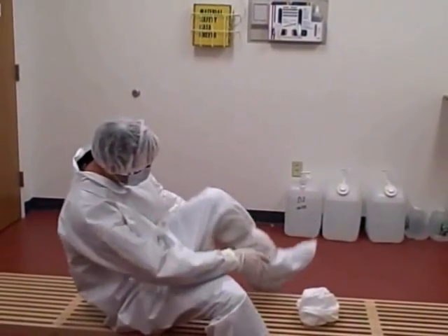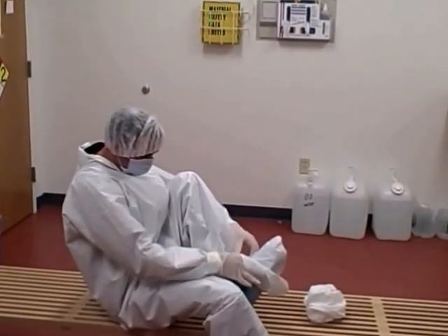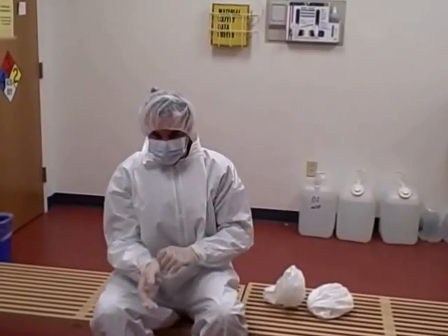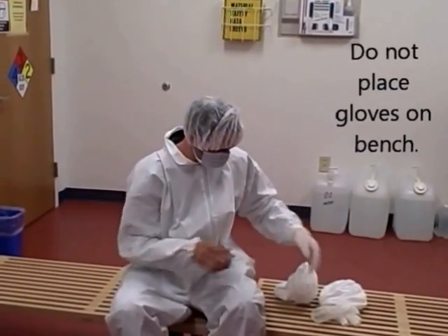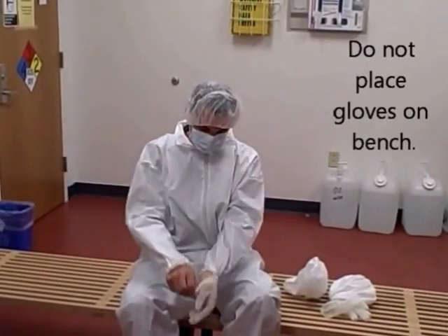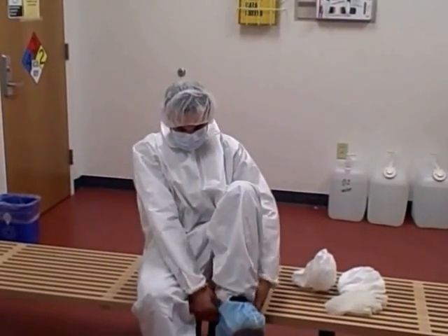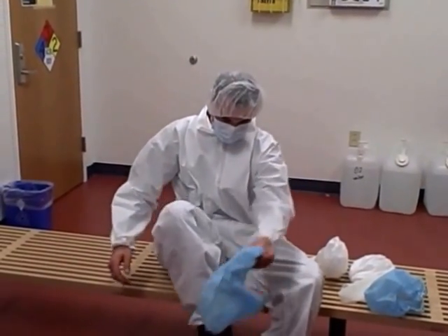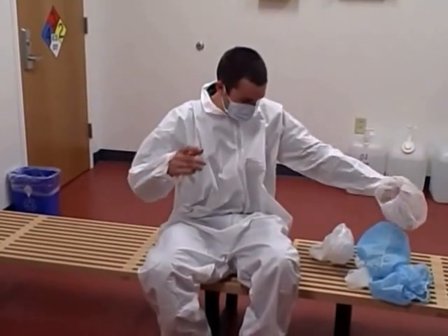Remember to swing your non-booted leg over the bench. Take off your gloves, removing them by the wrists. Take off your shoe covers. Remove your hairnet and your face mask.